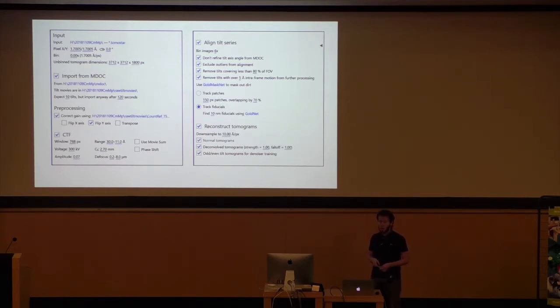Now, this has been probably the main reason why this has been delayed for so long. Basically, I've been trying to come up with an idea to improve tilt series alignment significantly over what IMOD already offers. And I have not succeeded in that so far. And at some point, I decided just, well, IMOD does it quite well, so let's just integrate IMOD.